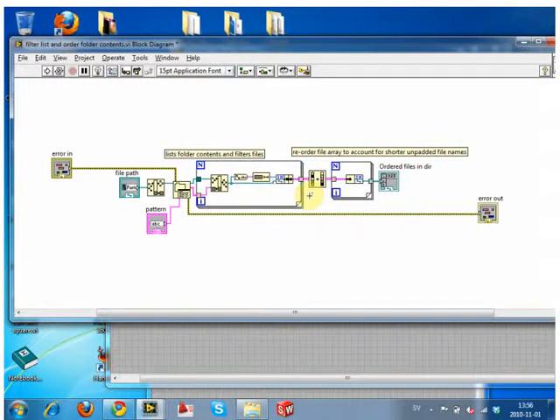string length. It'll then order them based on the second bit of information, which in this case is the file name. So it's ordering first based on length of file, and then it's ordering second based on what the file name is. So we're essentially saying, look, put all of them into categories of how long the file name is first. So file names of 10 characters, 11 characters, 12 characters, 13 characters. But then within each of those brackets, they need ordering too. So then it goes, okay, what other information do I have? Well, I have the file name. So then it uses the file name to order them within that.